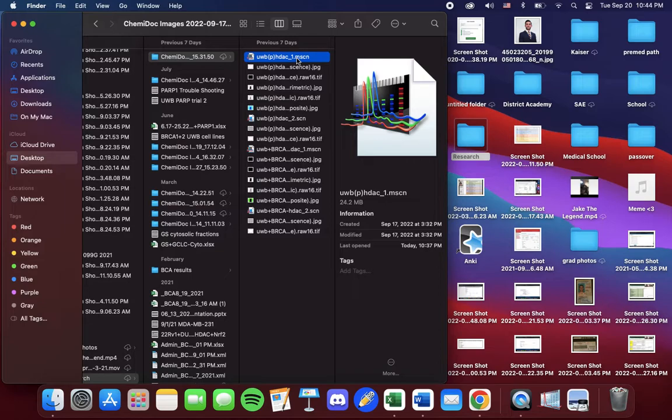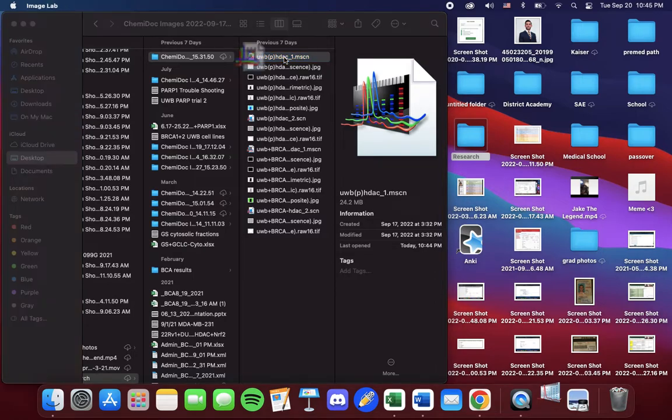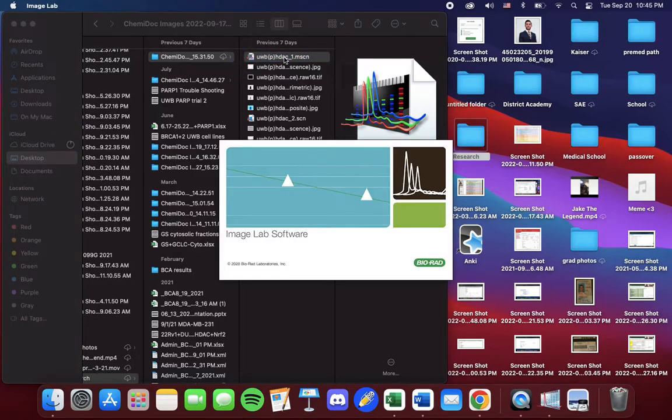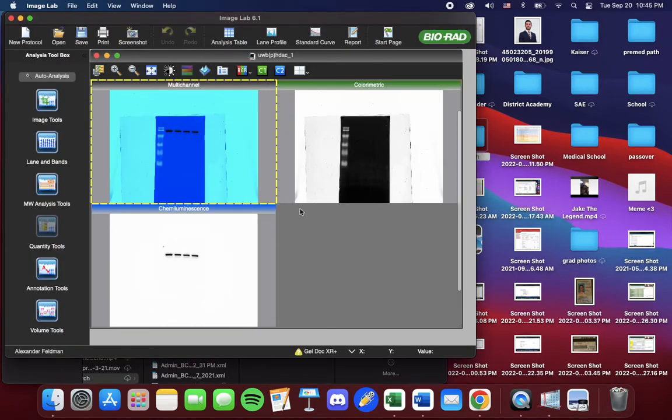These are the images produced from the multi-image. So we open it up and it will automatically open up with ImageLab software, the program.